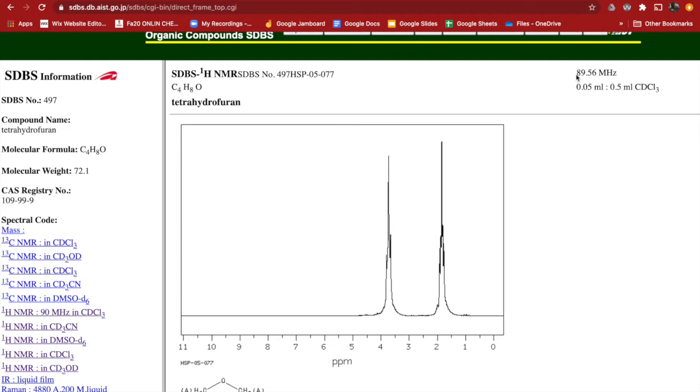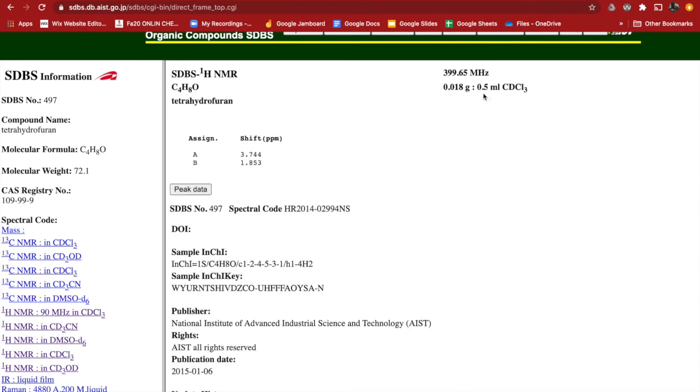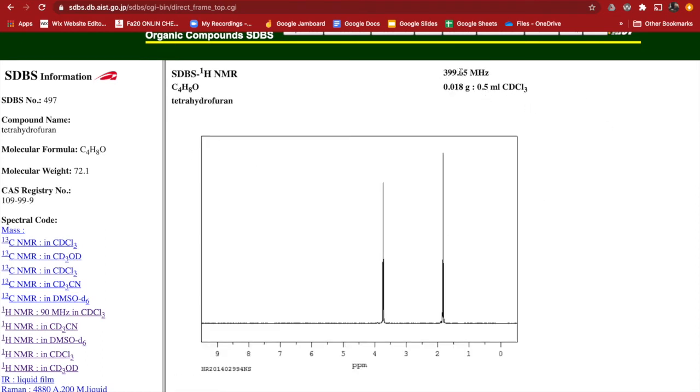But this NMR might cost you, I don't know, $100,000, whereas the high-end one, now you're talking $500,000 or more. Also, it has a cryomagnet that has to be cooled with liquid helium, then liquid nitrogen. Constantly having to refill the liquid helium and nitrogen, which evaporates over time, might be like 50 grand a year just for maintenance cost. So yeah, now back to another one.